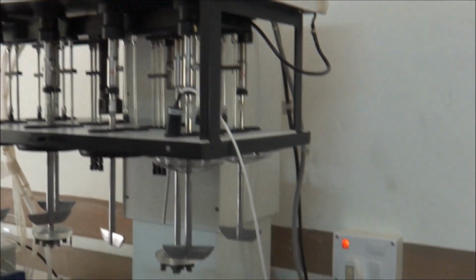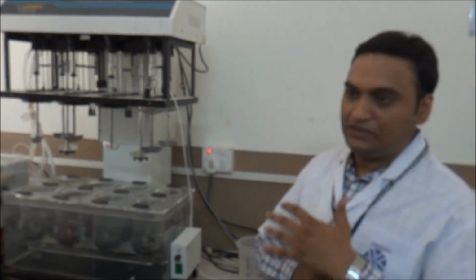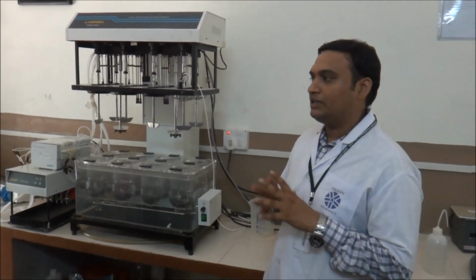Okay, now as you can see, in USP we have a total of 7 different types of apparatus: USP 1, USP 2, USP 3, and up to USP 7. But generally, most widely we use USP 1 and USP 2 as standard methods for evaluation of tablet dosage forms.